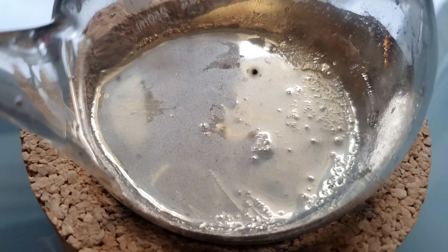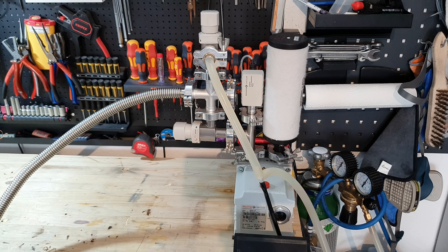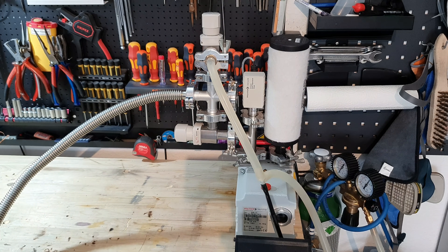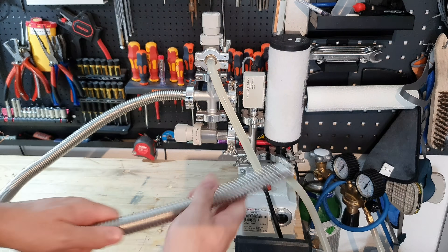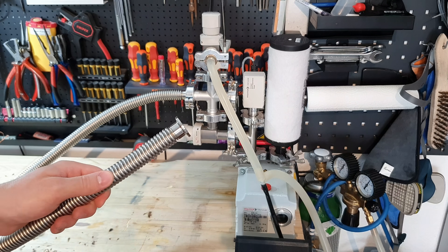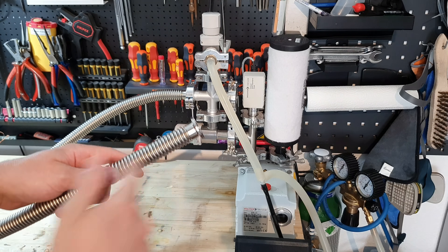The next step would be to transfer it into my still and redistill it two times. I sadly lost some footage, so this is a reshoot to explain what I was doing. I first transferred the cesium into my still and sealed the still by melting off the glass tube that was used to transfer the cesium. I then connected the still to my vacuum system with this stainless steel flexible vacuum tube.